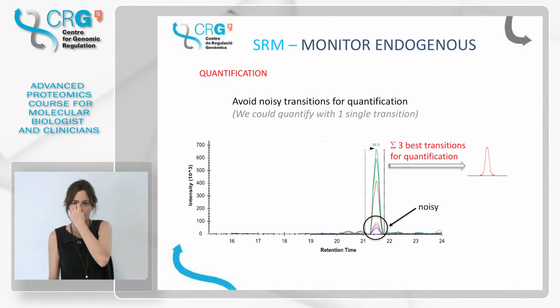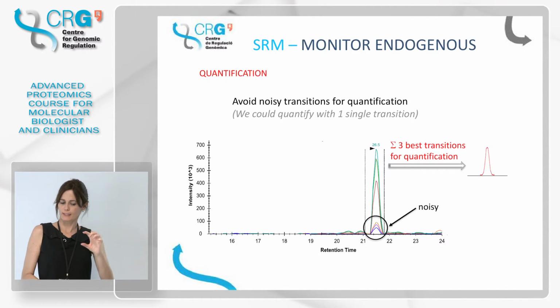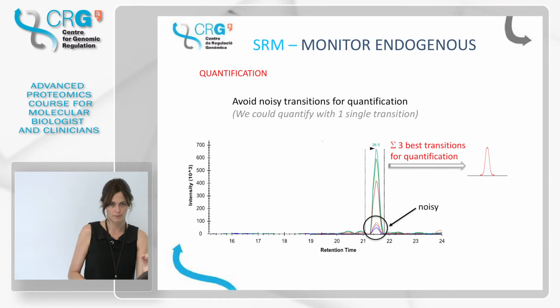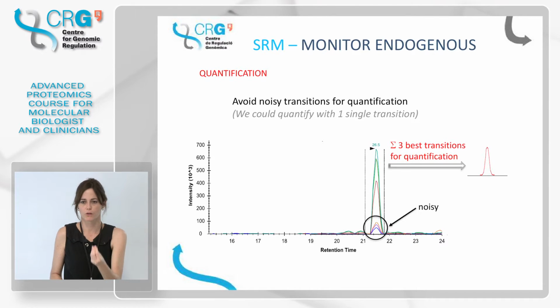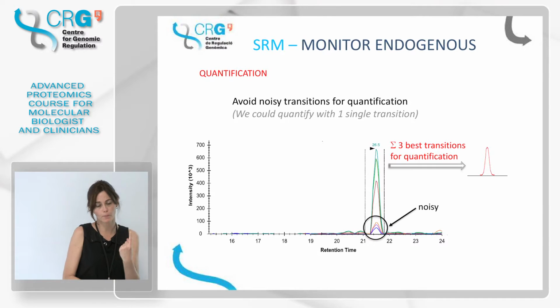But do you have to do the light and heavy, or is it possible to do only one? If you do this, you have to do both of them. Whatever you do to the light, this is a very good question, whatever you do to the light, you have to do the same to the heavy. The decision is going to be the same because they will be looking the same, but it's possible that this is a heavy peptide and the equivalent light, because the intensity maybe is quite low, then these ones are super noisy. Or even this one. And you decide to keep only one even.